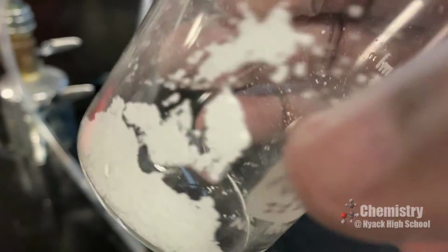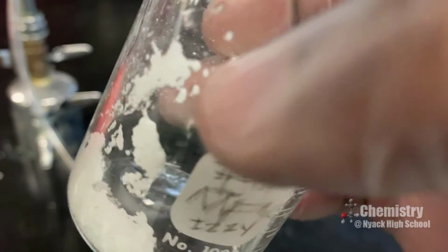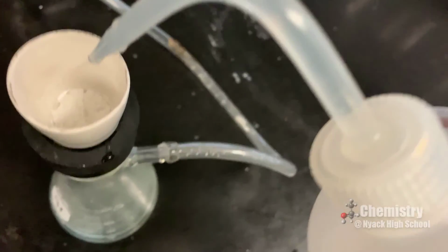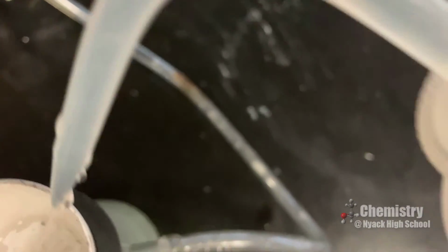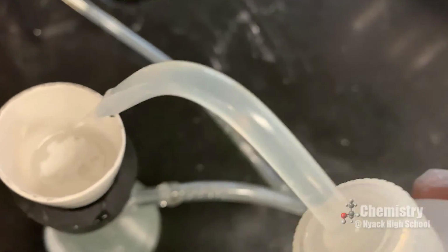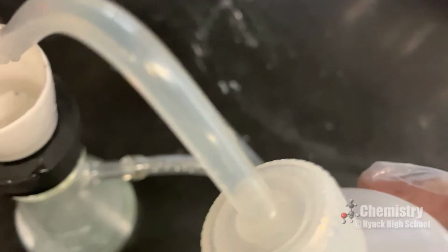So I have some silver chloride stuck to the sides of the beaker. I'm going to make sure I get it all by using my wash bottle and washing that into the crucible. This next step I didn't show, but this time I'm going to wash the silver chloride crystals with copious amounts of distilled water, and that is to remove any remaining ions that may be present in the crucible. I don't want them to recrystallize when I dry the crystals overnight, because that will affect my results.